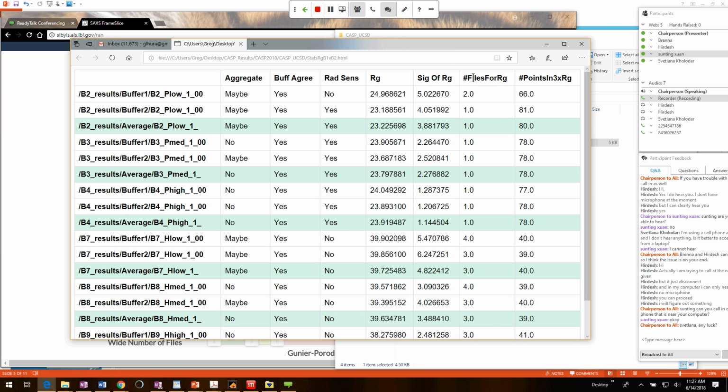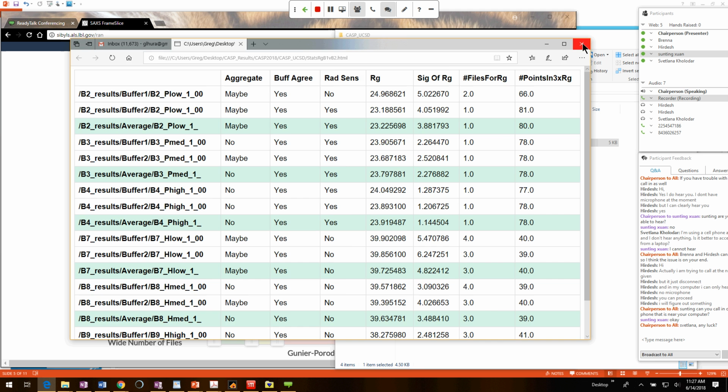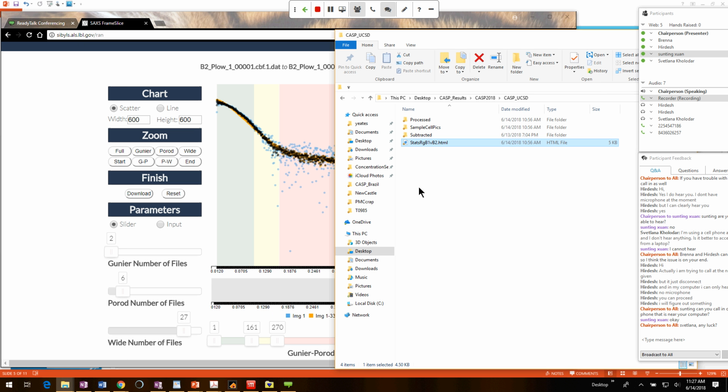And so anyway, there's some guidance here on these steps. So closing that further. So that's how you would create your primary scattering curves to work with. And that would be buffer 1. And then I'm going to pull up scatter here.